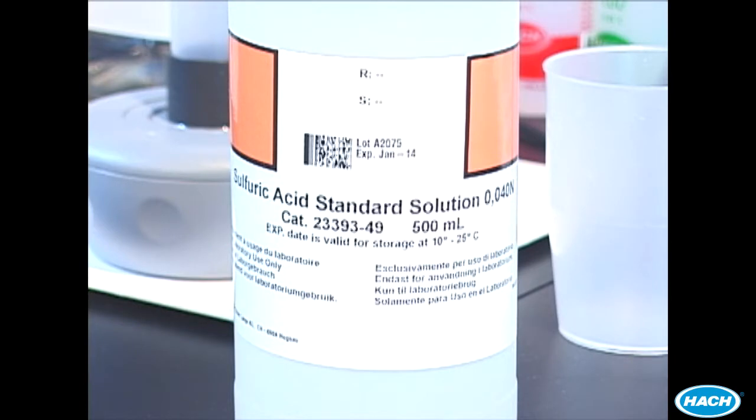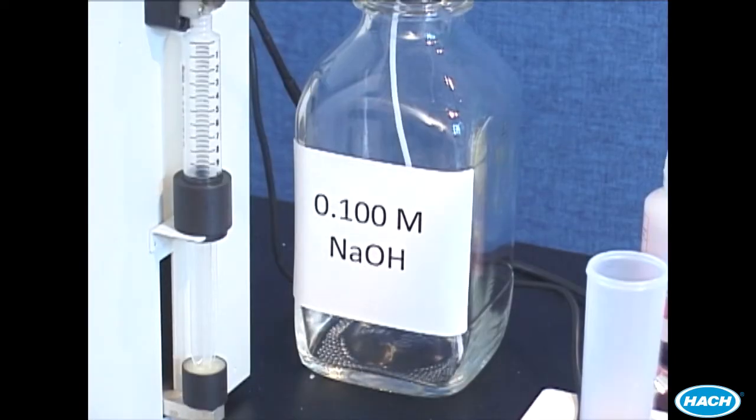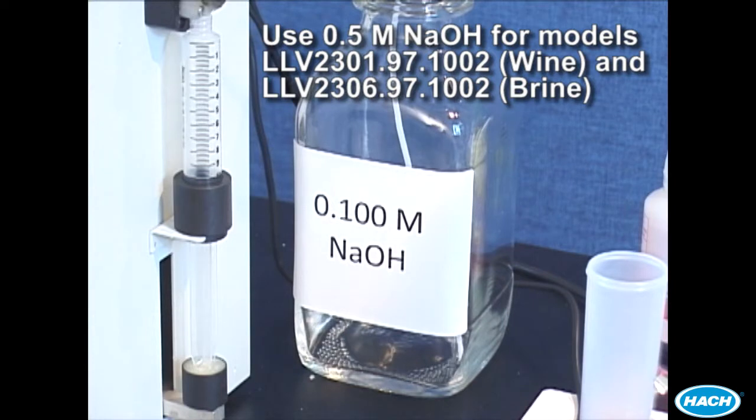We will use 0.1 molar sodium hydroxide as the titrant in this demonstration. Some methods use 0.5 molar sodium hydroxide titrant. This will also work but the expected results will be different. In this video the results for 0.5 molar sodium hydroxide will also be shown.